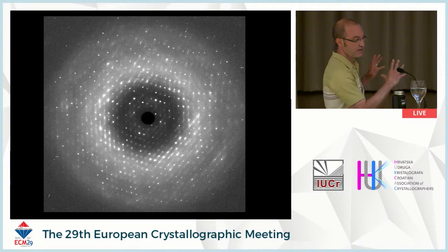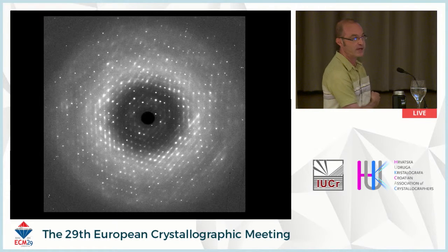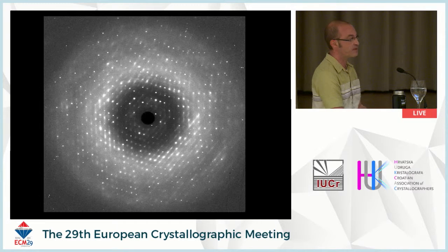This image is distorted on the slide in your view. It looks ovular, but actually this is meant to be a square image. And so this is protein diffraction. It's diffraction from a calmodulin crystal. It has a background pattern that we're all familiar with. To some degree in the background, we see this solvent ring, which is actually more or less equal parts protein and solvent in reality.